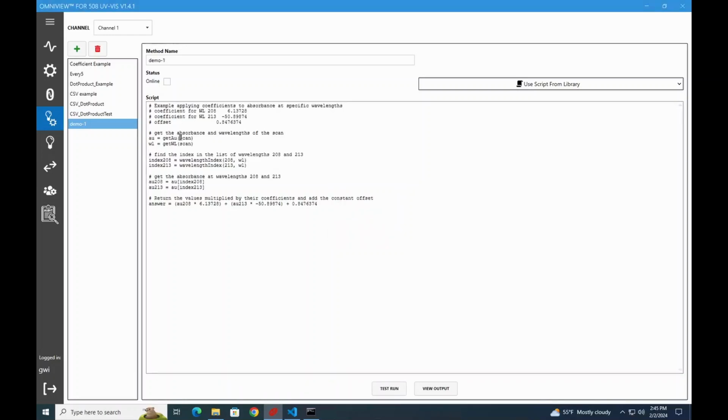So in this video, we have demonstrated that you can use the spectra produced by the analyzer to produce meaningful numbers. The contents of each method script are Python scripts, which we execute at runtime. Let's demonstrate how it works by putting the method online. Now that this method is online, every time we take a scan, we are going to run this script, and scan will have the integer ID of that scan that we just took, and we will get values. So let's go try that.